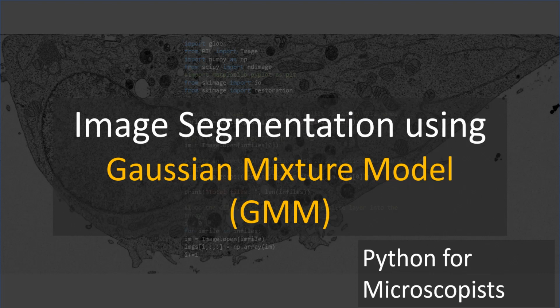This is unsupervised segmentation, and supervised is where you can actually supply a labeled image where you, let's say, paint the pixels and then label them and say, okay, here are the regions that I am saying are my ground truth, and use this to train the algorithm, and in future for other images, use that trained model to segment future images. So as you can imagine, that's a supervised segmentation.